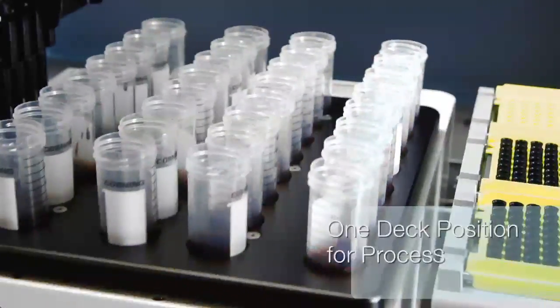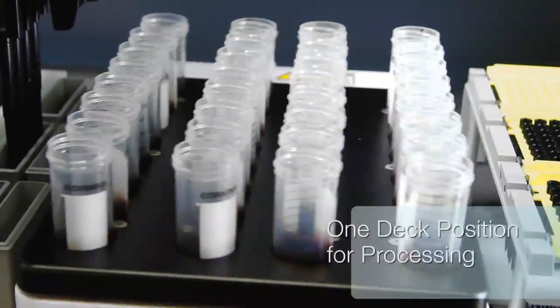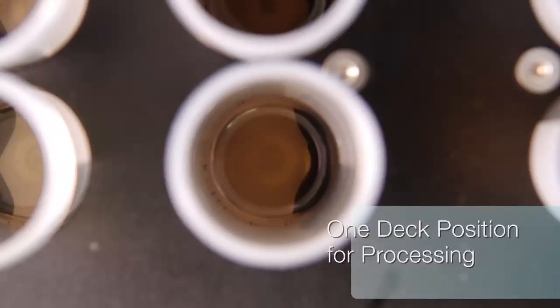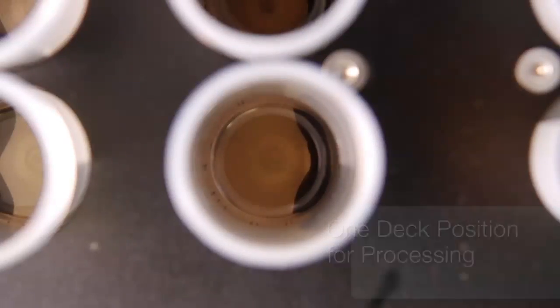Samples remain on deck for processing until elution. The HSM 2.0 device provides the heating, shaking, and magnetic capture required. No need to move the plates or labware.